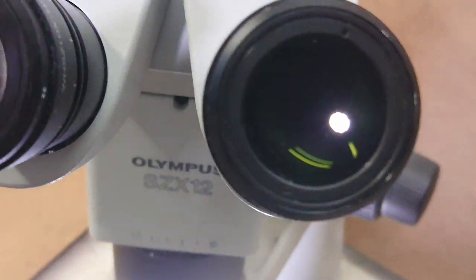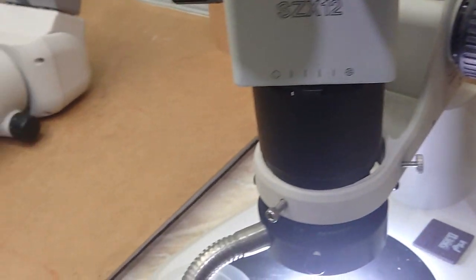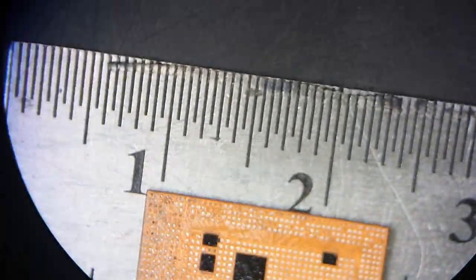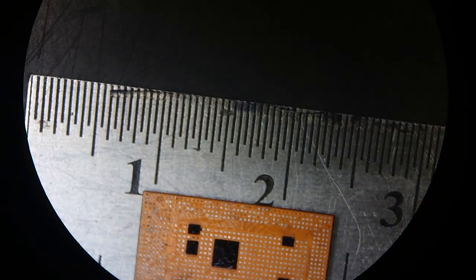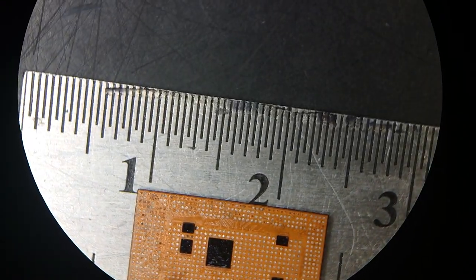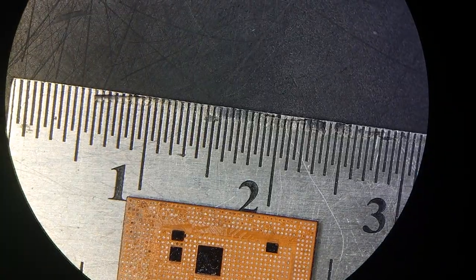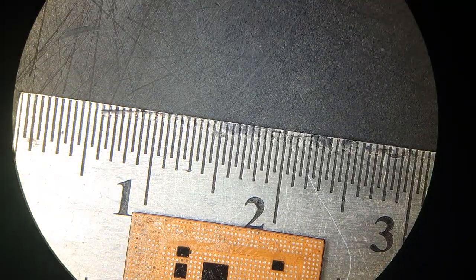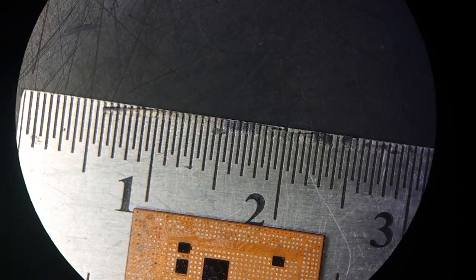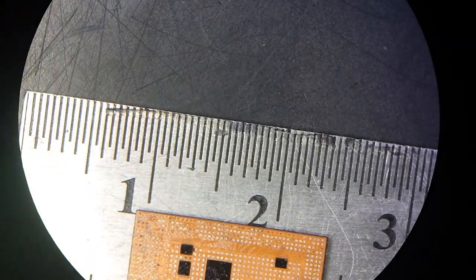Let's now measure the size of the field here. Not that easy to get the size of field. Okay, let's put eyepieces. With a lower zoom, our field of view is kind of 33 to 34 millimeters. Just a nice field of view.